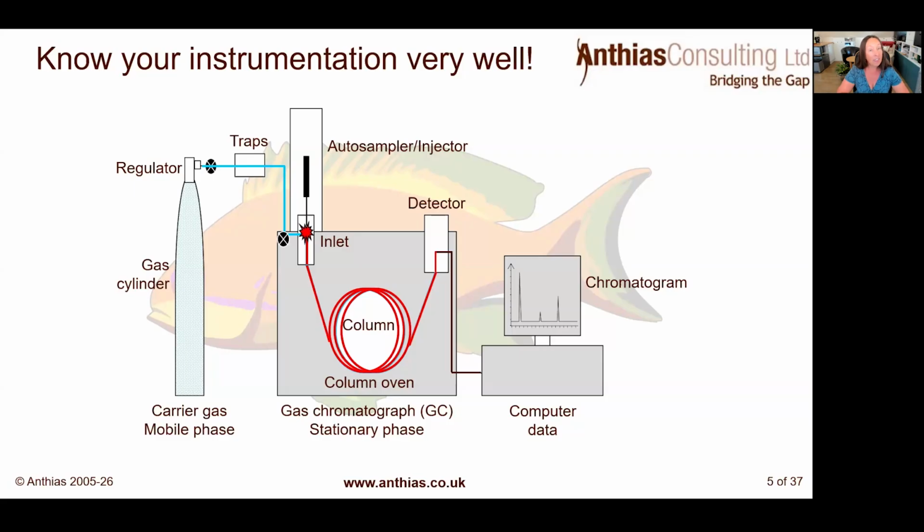And of course, we shouldn't forget our software. Have we got the right acquisition rate? Are we collecting the right data and the right information? Have we got any thresholds being set? What about our integration parameters? Is that the problem?